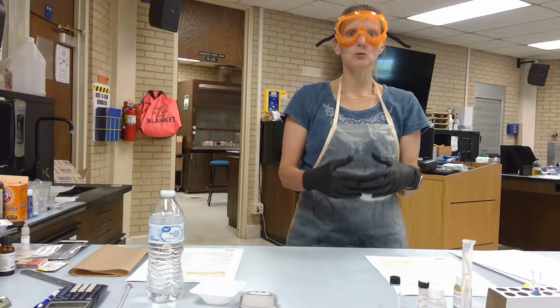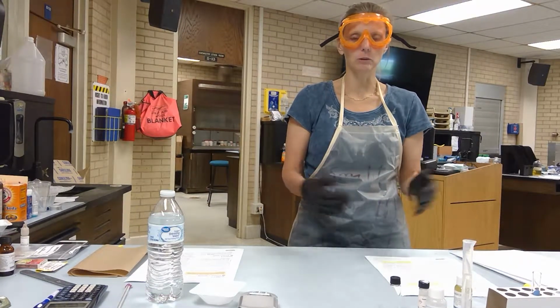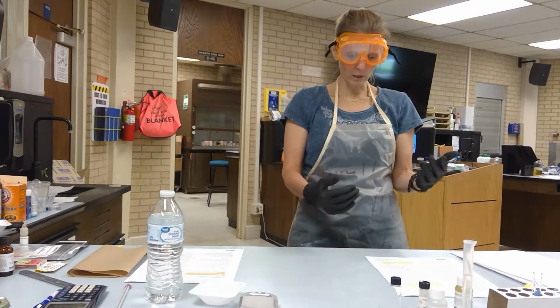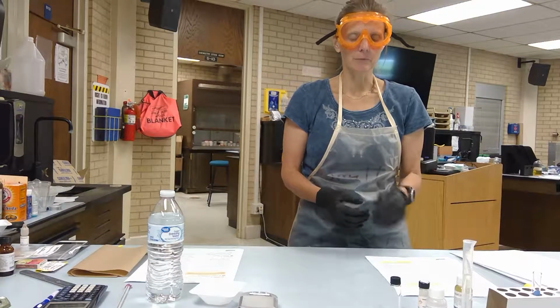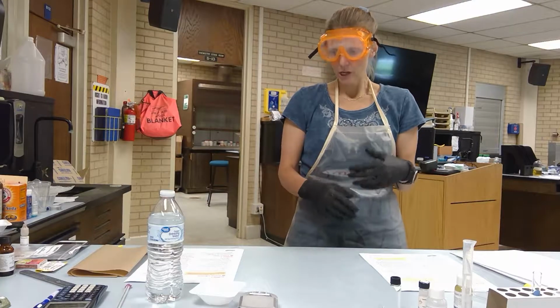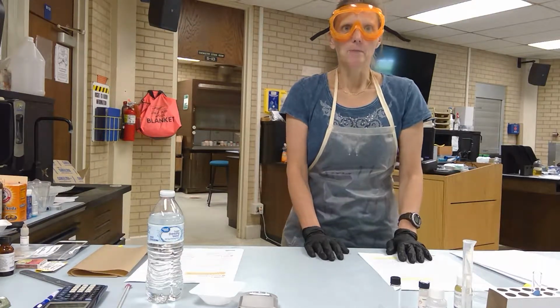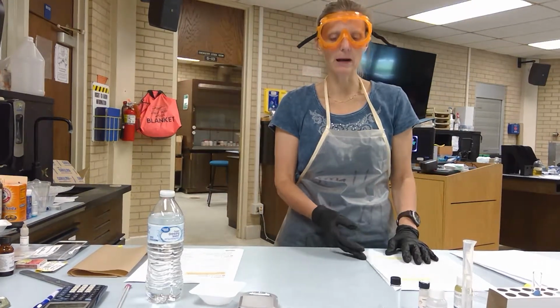But you run into some issues, and one of them is you need to filter that used vegetable oil, because you have food particles, you have contaminants, and one of the potential contaminants that arises is free fatty acids. And so in the process of completing activity 1 and activity 2, you're going to test for complete transesterification. That's a big word. It's like smelting. Anyhow, and then you'll also test for the quality of the biodiesel.